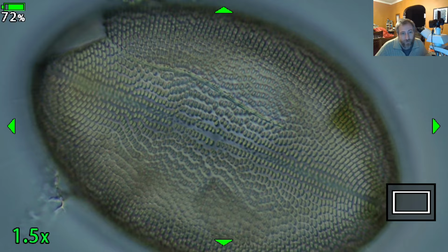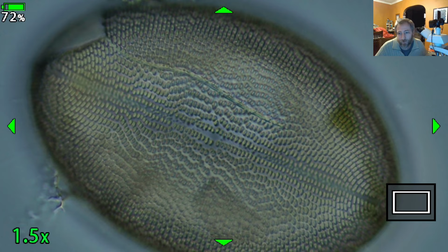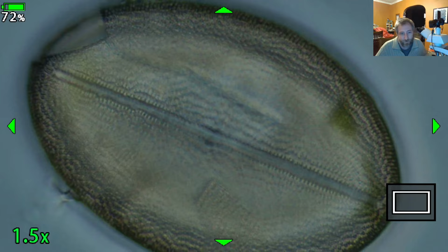So, this diatom that we have on the microscope right here in our field of view is Cocconeis. And Cocconeis is a monoraphid diatom. You can see this one's been broken. It's actually a pretty large diatom. Sorry, I don't have a scale because I'm using my camera again rather than the one that came with the microscope, because I think this one has much better optics. I hope you would agree with that.